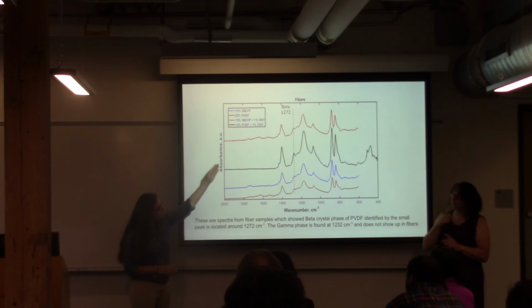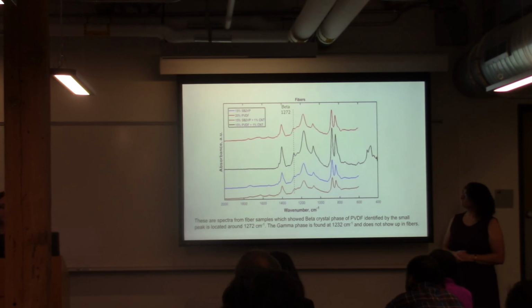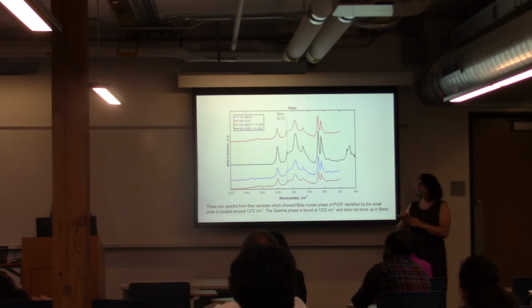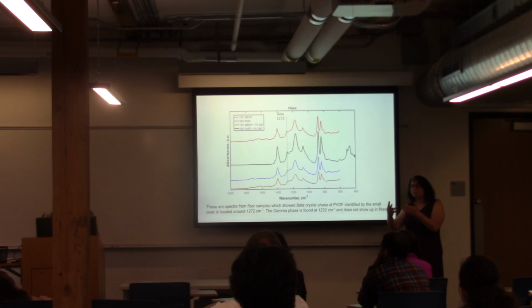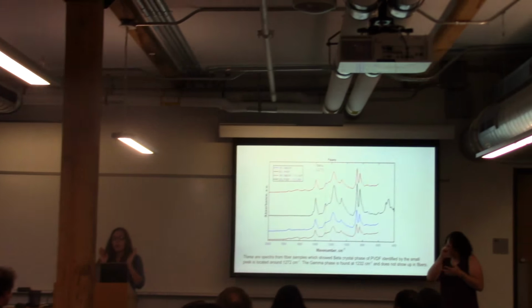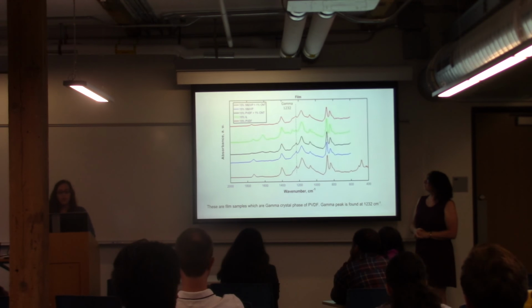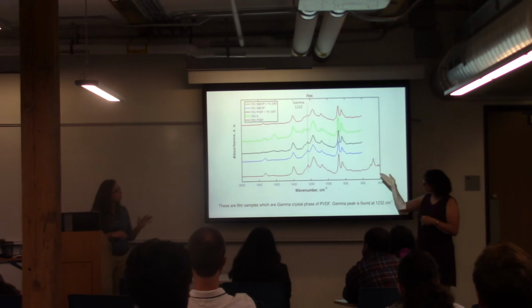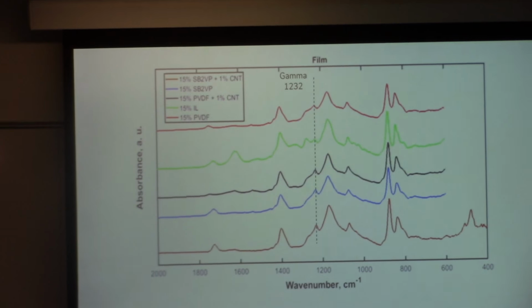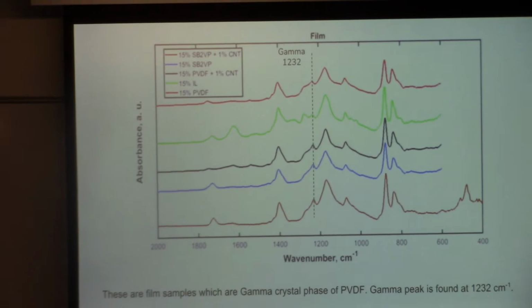On this line, it just tells us where the peak is, but it stopped at around 1272. When I showed it on the table, it's not exactly the same number, but it's close to it. So it helps us say that this is what it is. I also did the same thing with the film only, and it shows that it is around 1232. It's not exactly the same number again, but it's close to what we have on the table.